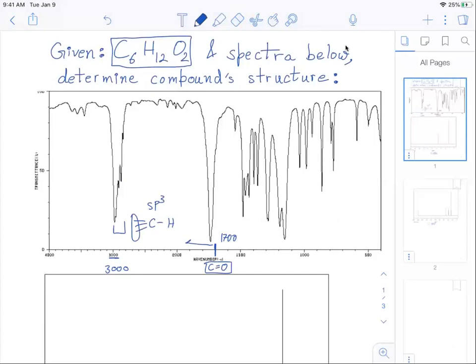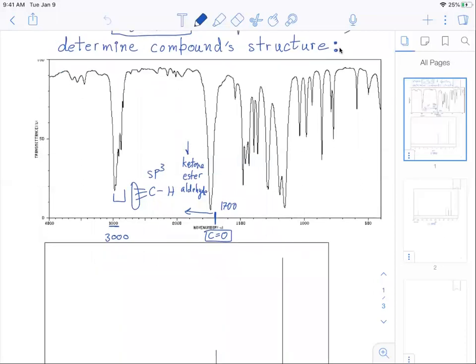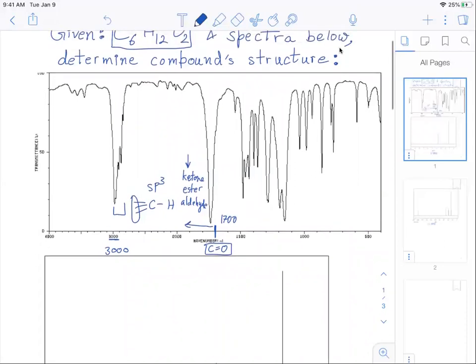Now we do have a peak coming to the left of this which usually could indicate ketone or it could indicate ester or it could indicate aldehyde. Now the ketone, ester and aldehyde they all have very specific signature peaks that we can look for. So usually we figure out if it's a ketone by the process of elimination because ketone doesn't have a specific peak.